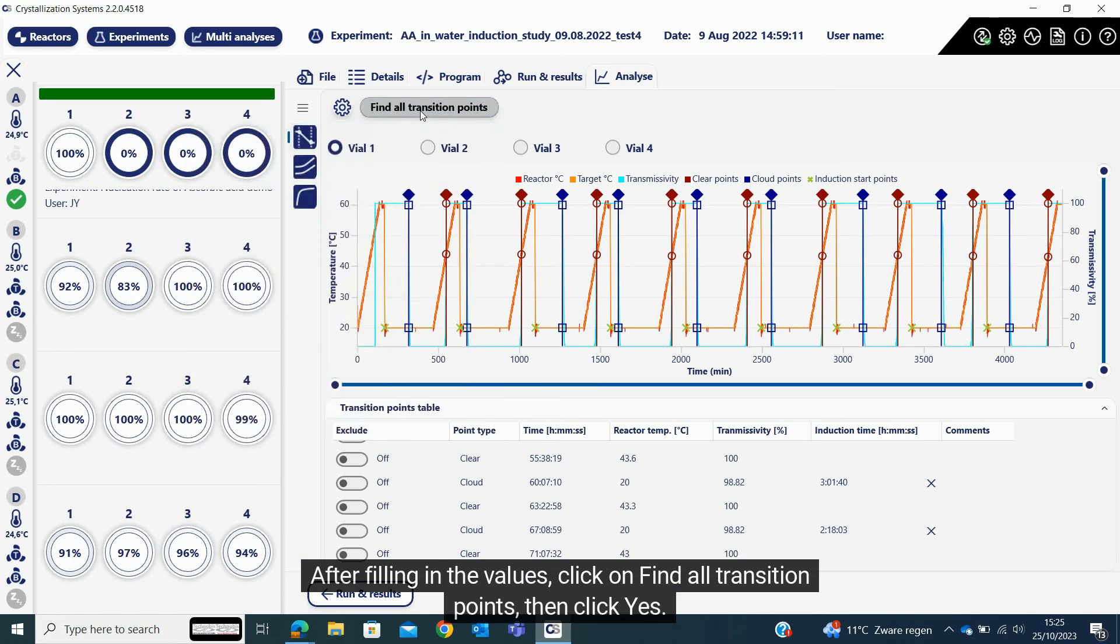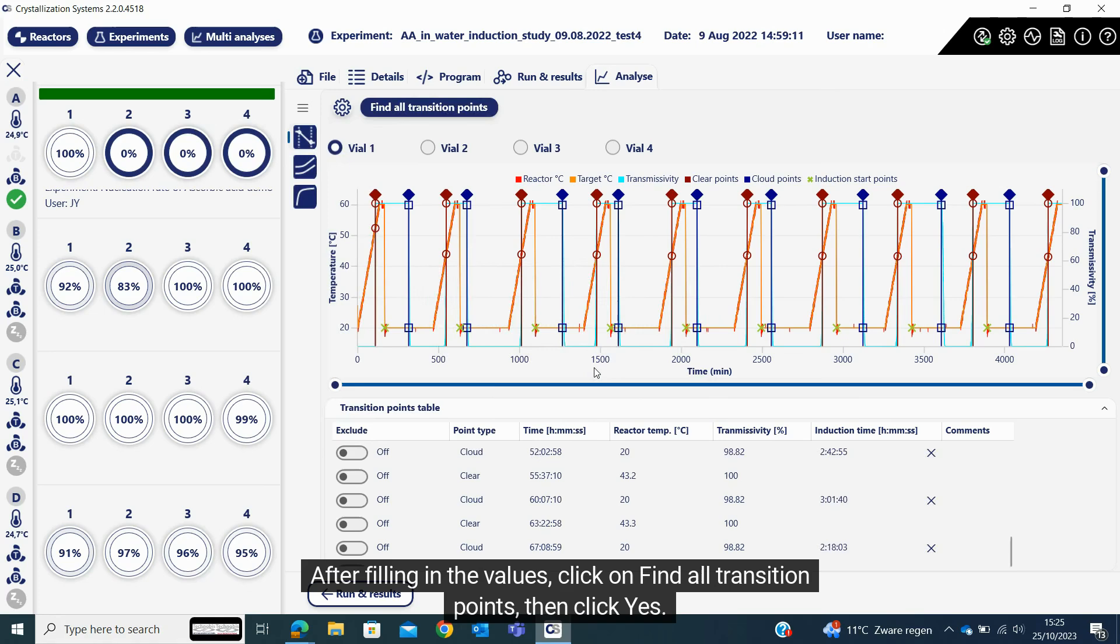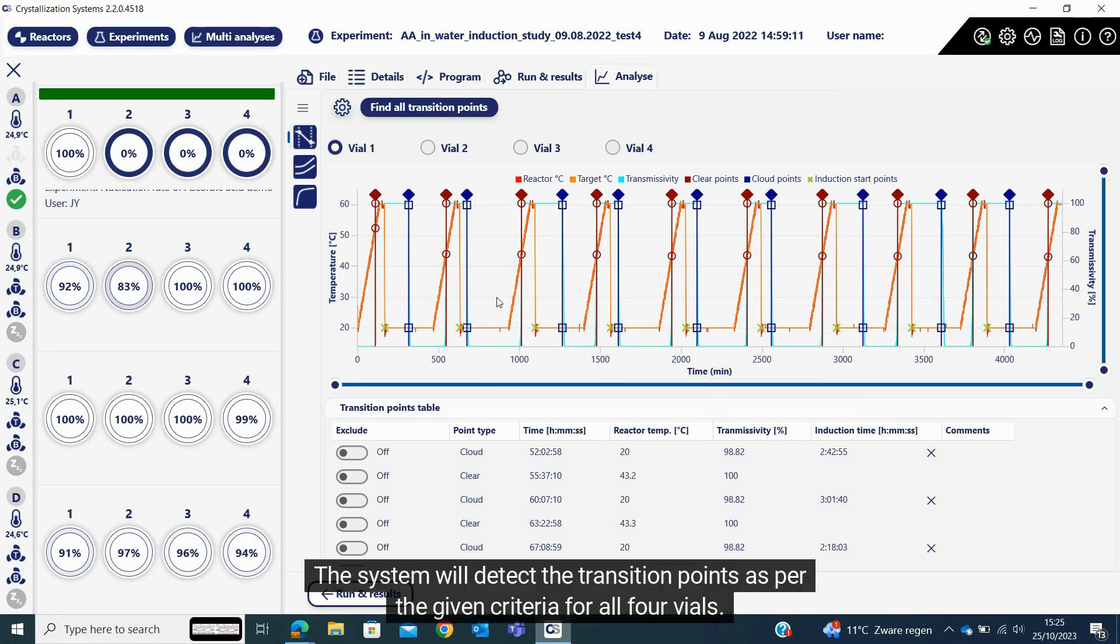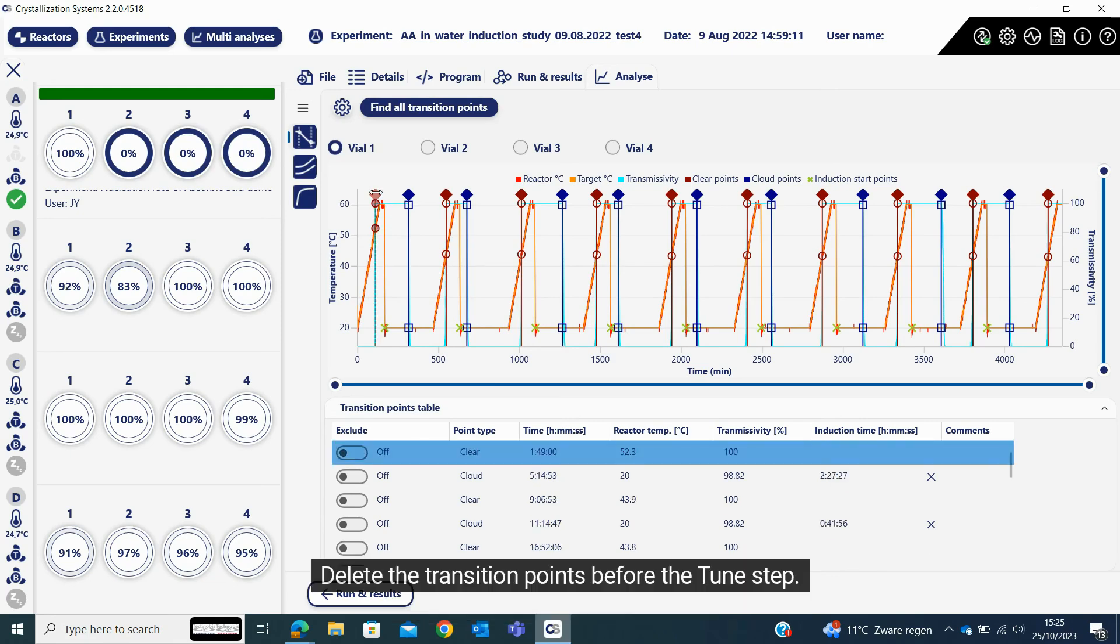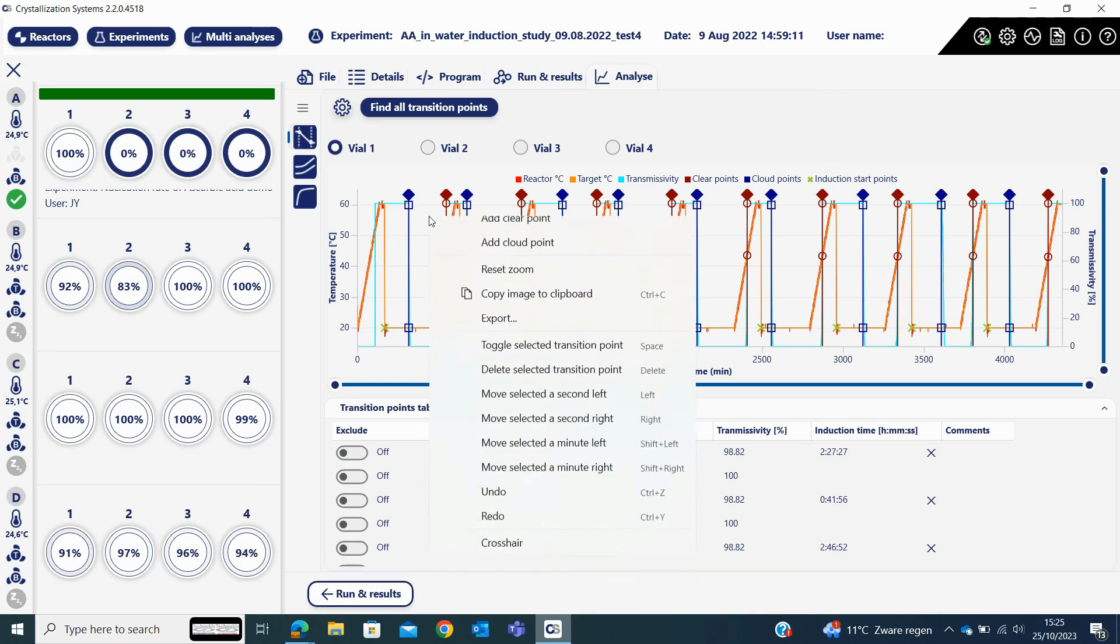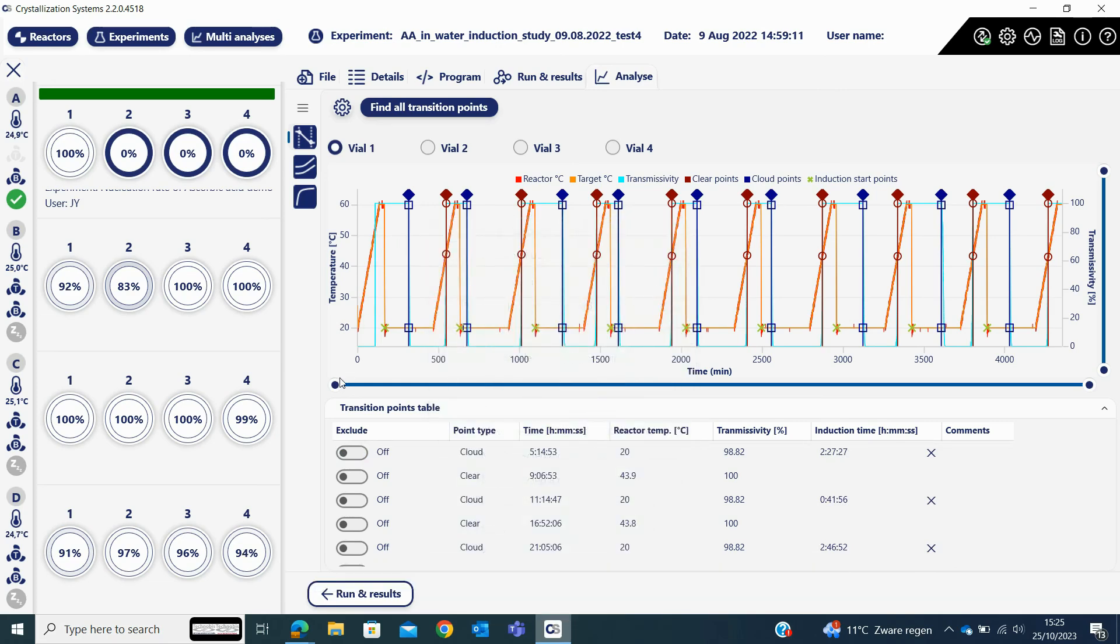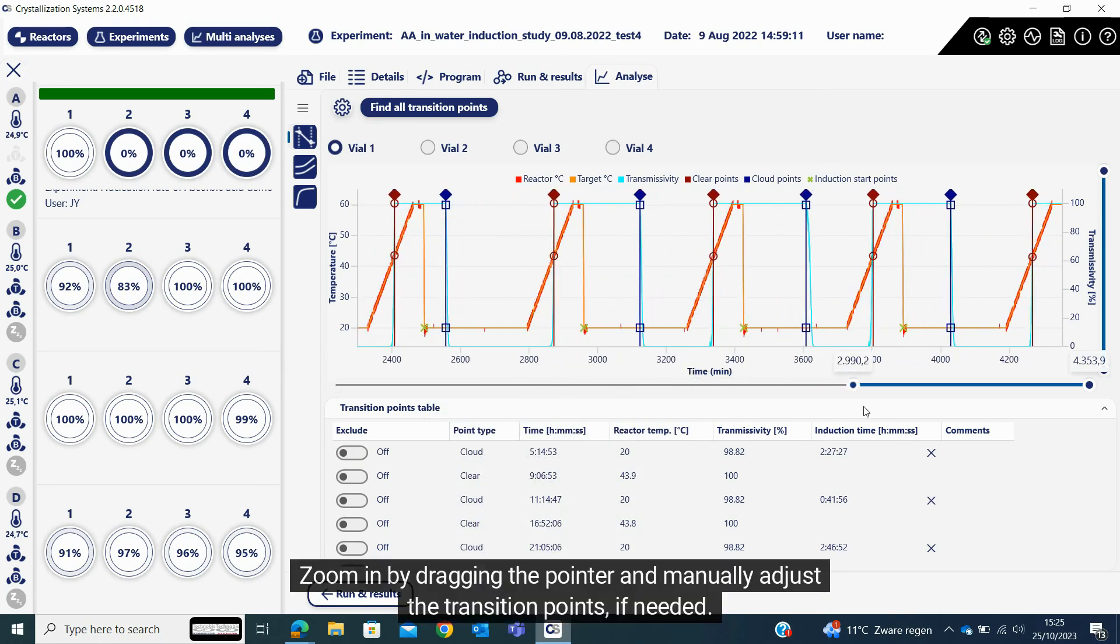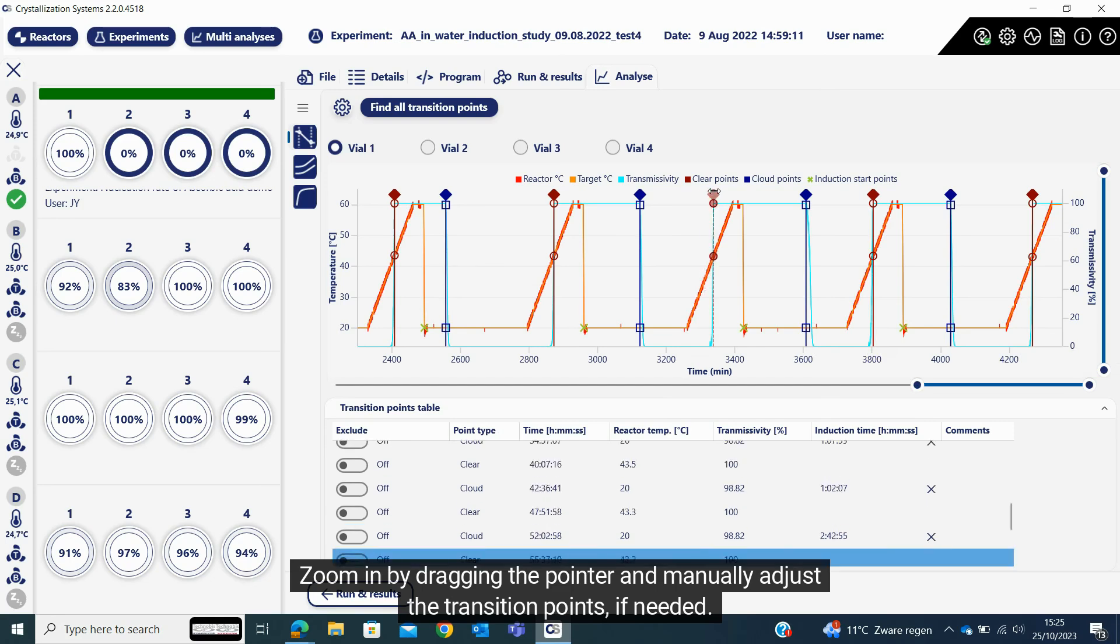After filling in the values, click on find all transition points, then click yes. The system will detect the transition points as per the given criteria for all four vials. Delete the transition points before the tune step. You can add or delete transition points by right clicking on the graph. Zoom in by dragging the pointer and manually adjust the transition points if needed.